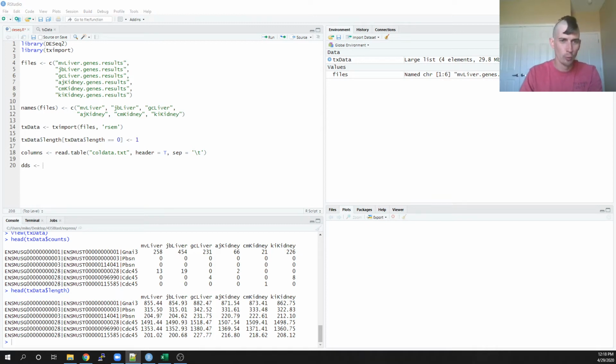And so we're using a specific tool that's DESeqDataSetFromTximport. So tximport was designed so people who don't have great Python skills or really any parsing skills can still use this package.